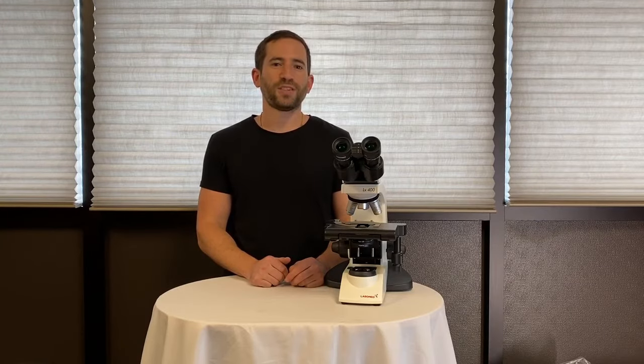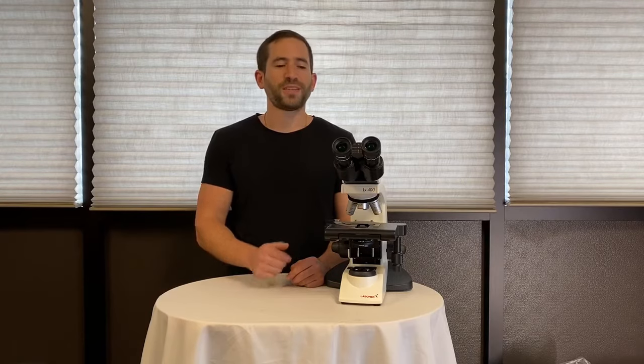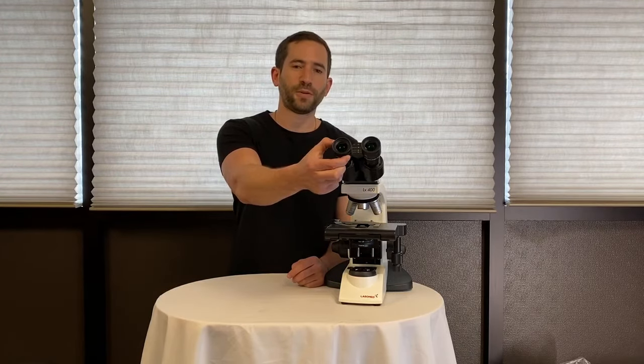The Labamed LX400 is a great entry-level laboratory grade and student microscope. The 10X eyepieces provide a large 20 millimeter field of view.